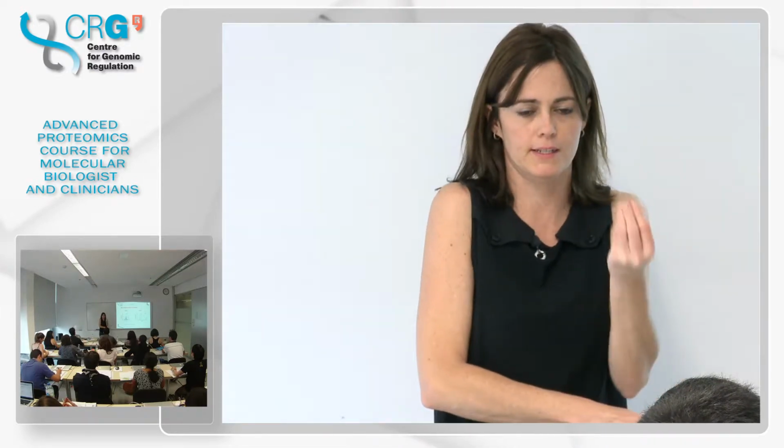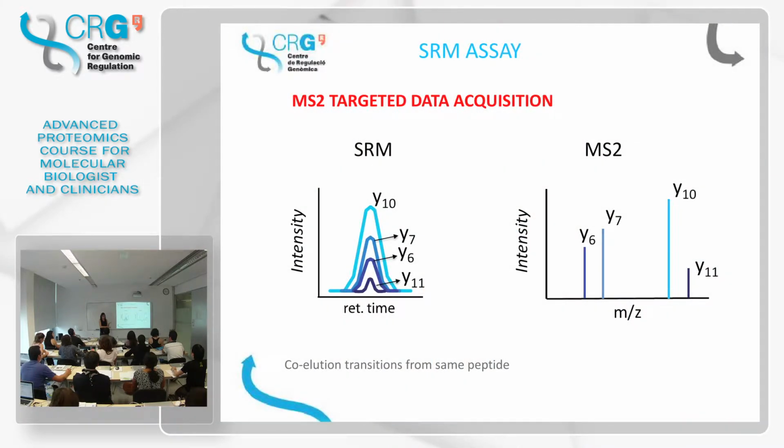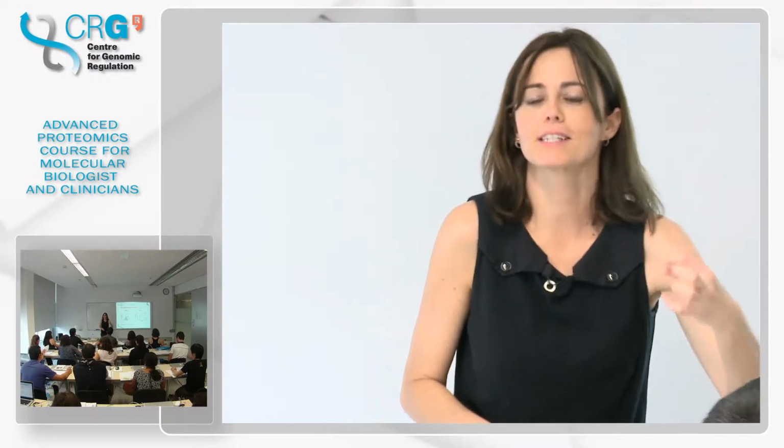Yeah, because when we fragment a peptide, the peptide has a certain abundance. The abundance is 1, but some ions are more intense than others, because this depends on the exact sequence. The same way that 2 peptides that come from one same protein, some have higher intensity than others, and they all come from the same protein and the same amount in our sample. But the fact that they have lower intensity doesn't mean that there's less of them. Well, there is less of these fragments.